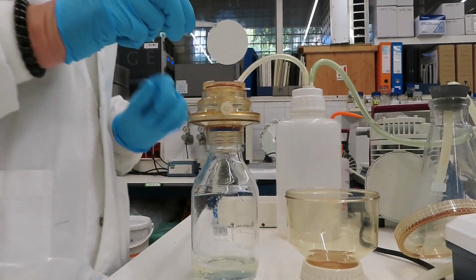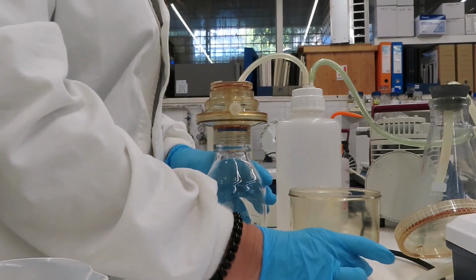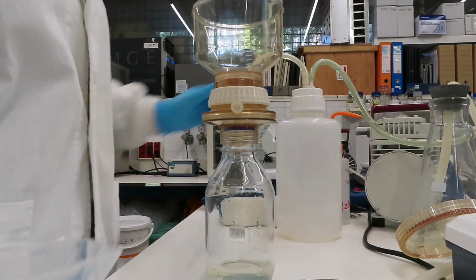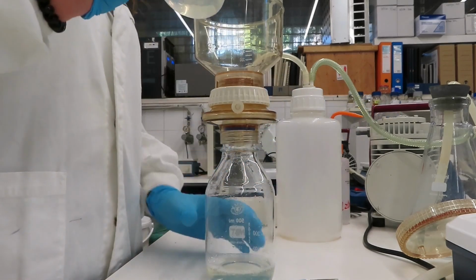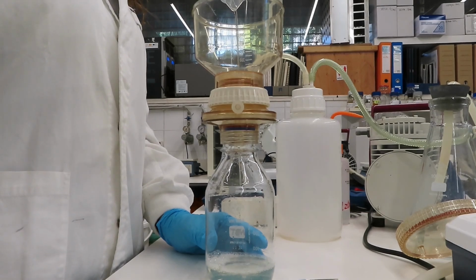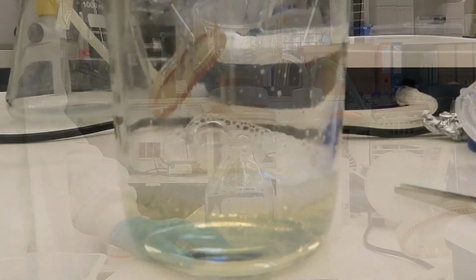Before starting the purification procedure, it's necessary to prepare the sample. First, it must be filtered through 0.22 micrometer filters in order to remove cell debris that could clog the resin columns. Later on, the pH must be checked to be sure that it's above 7, since the pK of the side chain of histidines is 6.0. This is an essential step to assure that histidine tags bind to the immobilized metals.